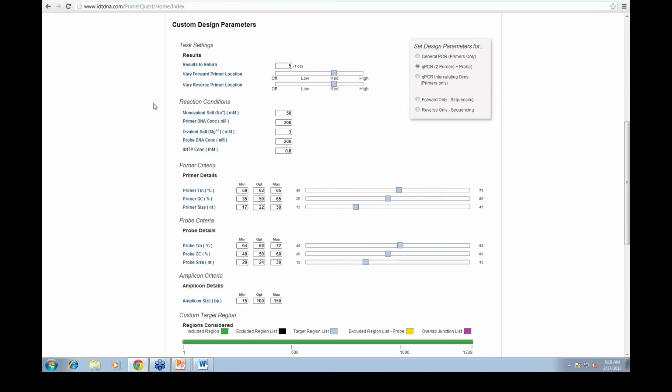For example, if I determine the TM of a primer using 0 for both of those salt concentrations, the calculated TM of the primer can be 5 to 10 degrees lower than the calculated TM when using actual reaction conditions, having those concentrations for the salts. Although PCR and qPCR are rather robust, incorrectly calculating the TM could result in inefficiencies in the reaction. Any of these values can be adjusted based on the actual values in your master mix prior to designing your assays, but we would always want to make sure that there is some sort of concentration, especially for those divalent salts.